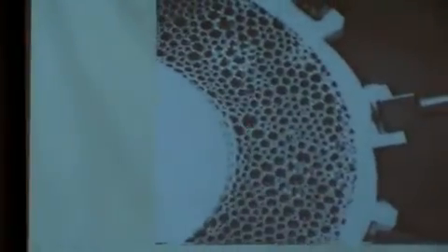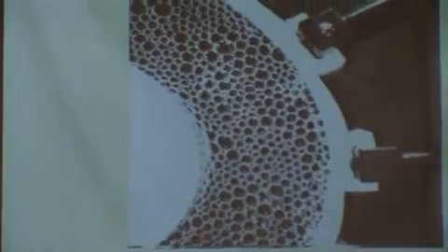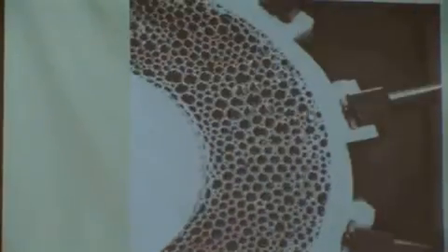So what you want to look for in this: you might be able to see a dust particle here. This is that inner disk that rotates at the beginning. Because at the beginning, it's a solid. And what does that mean? That means as I try and move it, the forces go up in proportion to how far I move it. Those increasing forces move the inner cylinder.